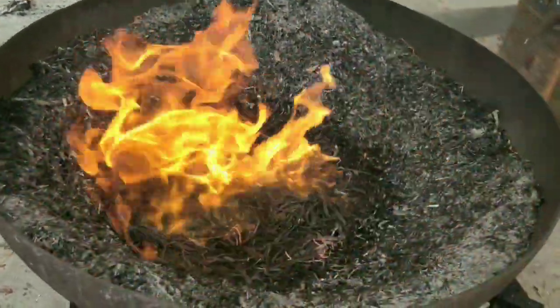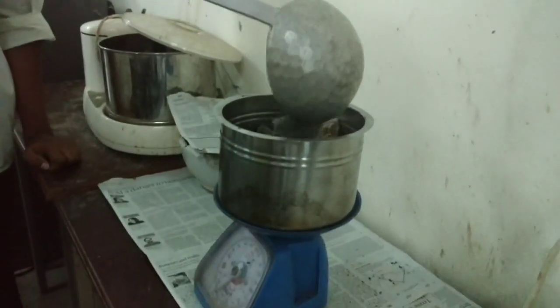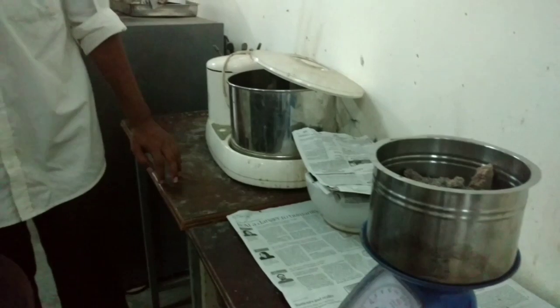The ash produced is taken and weighed. From 10 kg of Abamarga, we obtained about 900 g of ash.